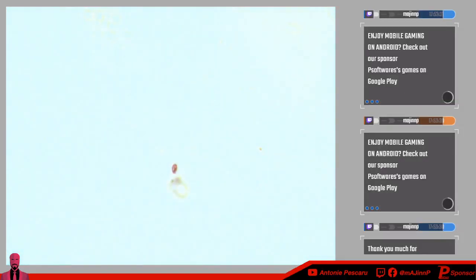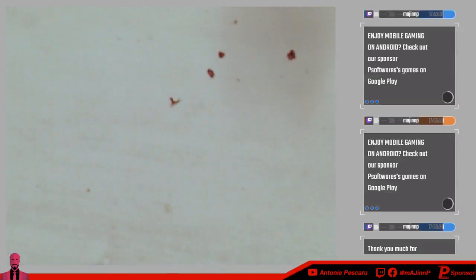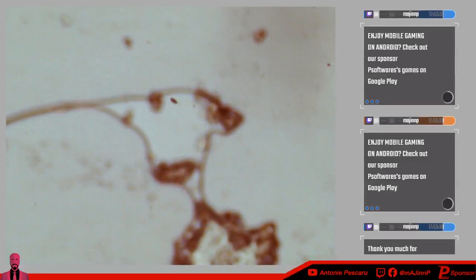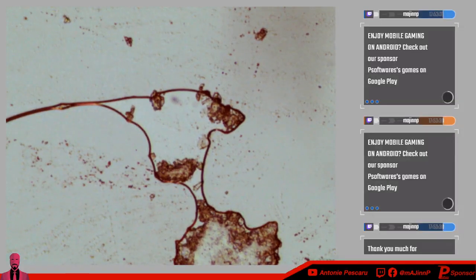It takes a while until you spot them. I'm trying to find the ones that are grouped up, bunched up a bit. Some of what I saw, I think, are dust particles. This isn't a cell.